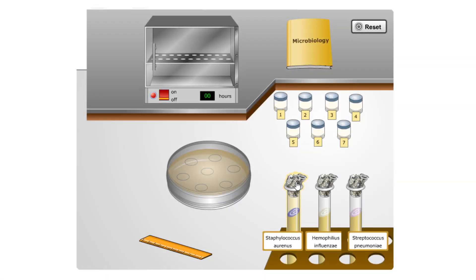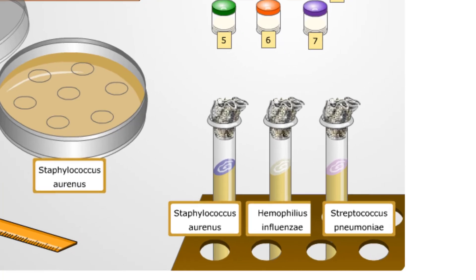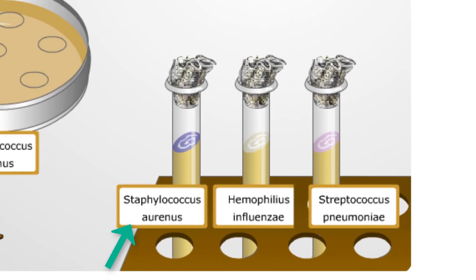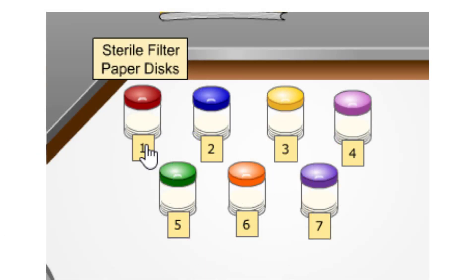Let's look at our procedure. First, we will inoculate the agar in the petri dishes by clicking one of the test tubes containing pathogenic bacteria. We have the choice of Staphylococcus aureus, Haemophilus influenzae, or Streptococcus pneumoniae.